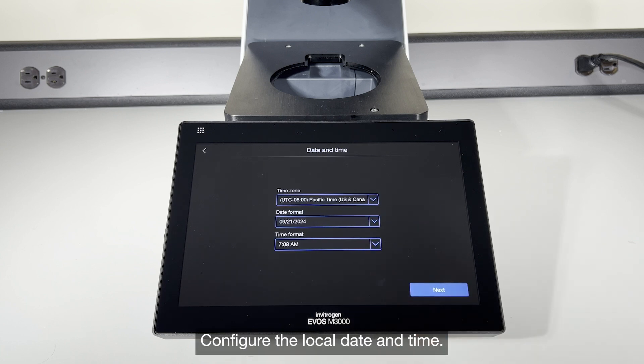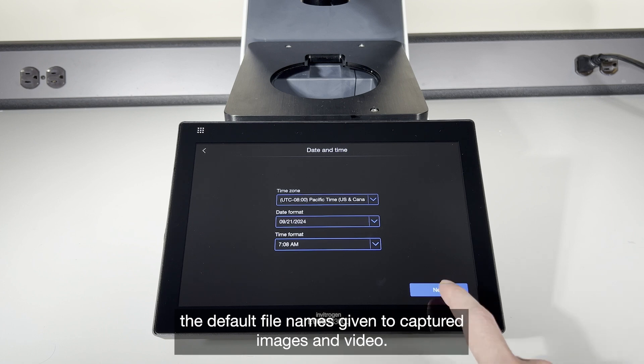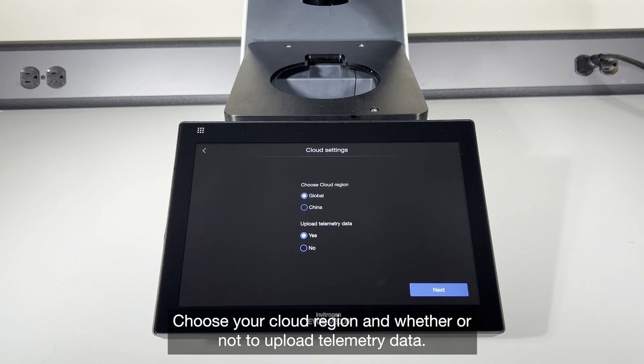Configure the local date and time. In addition to being displayed on the system, these settings will affect the default file names given to captured images and video. Choose your cloud region and whether or not to upload telemetry data.